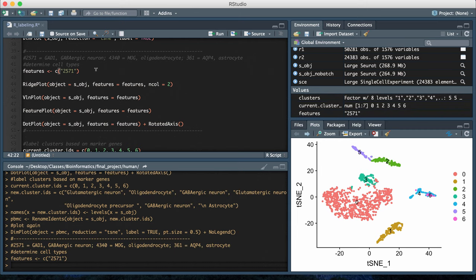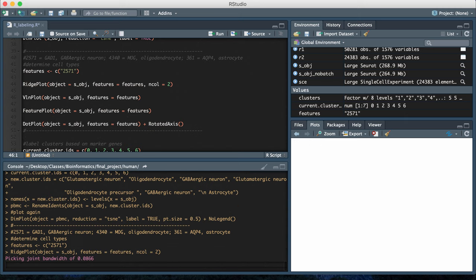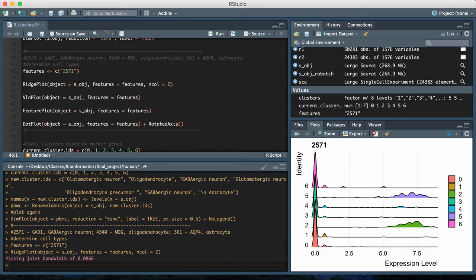I'm going to save that as a feature, and then Seurat has four plots that you can use to figure out how to label your clusters. It has ridge plots, violin plots, feature plots, and dot plots, and usually these will all show you kind of similar conclusions.